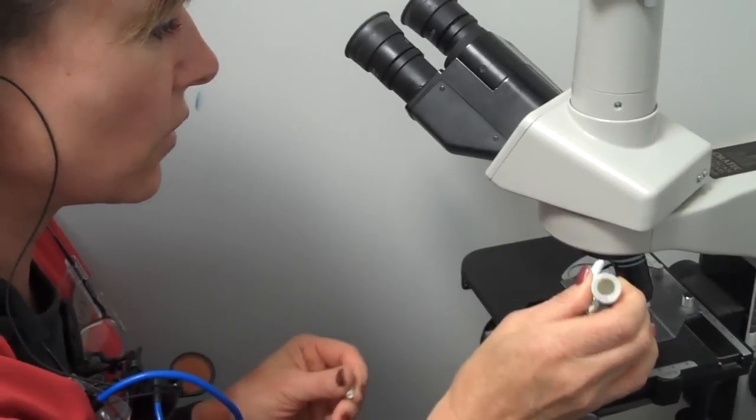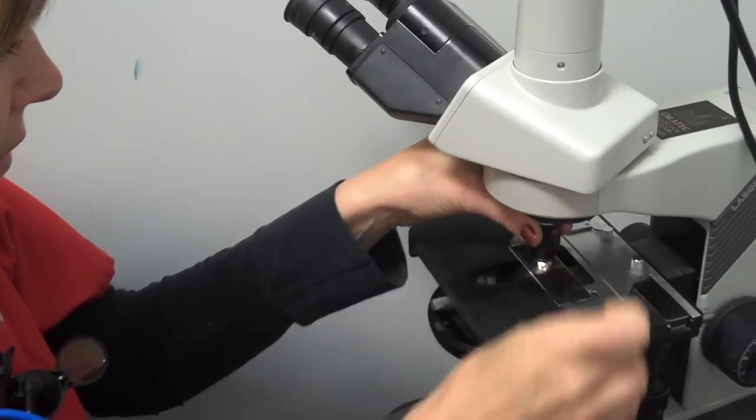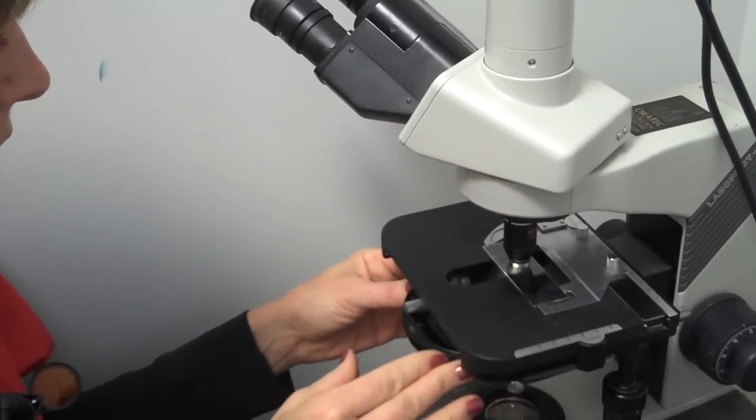We'll put a little bit of oil immersion on the slide, switch it to thousand power and make a couple of adjustments here. And now we have — normally I'd look at it through the microscope first, but just so that you can see, we can see things much more clearly.